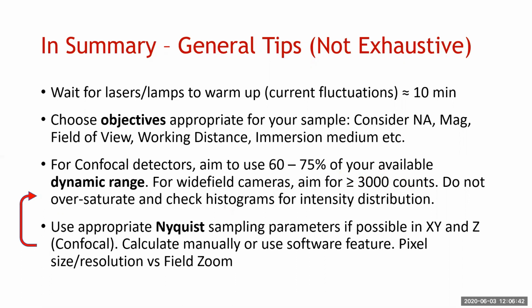And always check the histograms. The histograms will give you a quick idea, instead of numbers, and especially not images, of what your intensity distribution is.